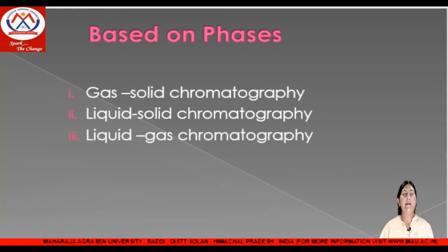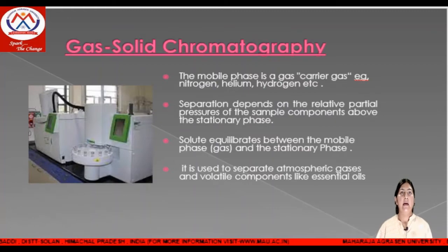Next is the classification of chromatography on the basis of the phases. First is gas solid chromatography, second is liquid solid chromatography, and third is liquid gas chromatography. This is the instrumentation picture of gas solid chromatography.